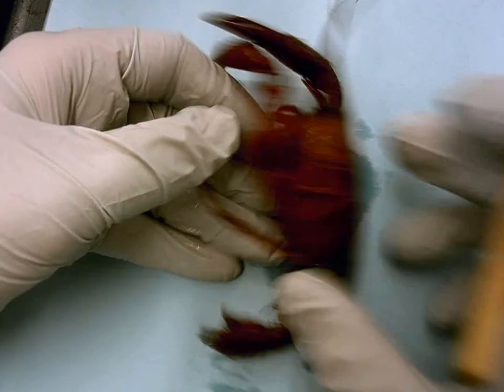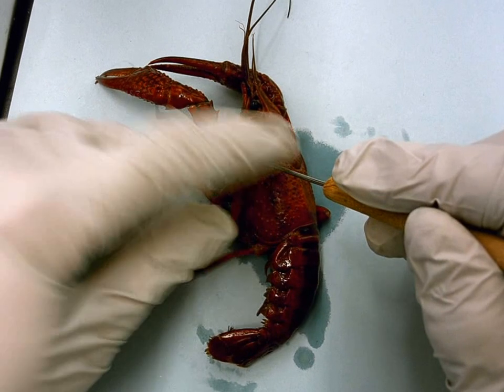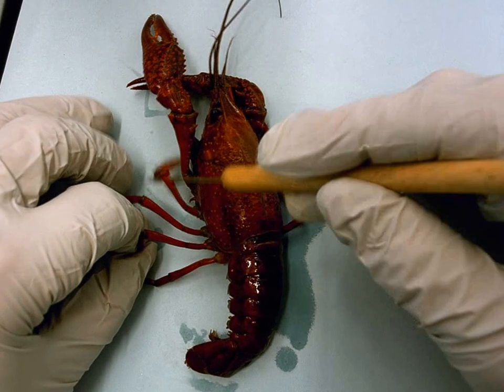For the thorax — the chest region — that would be the walking legs. You can see all these walking legs here: the first, second, third, fourth, fifth — which of course makes it a crustacean.